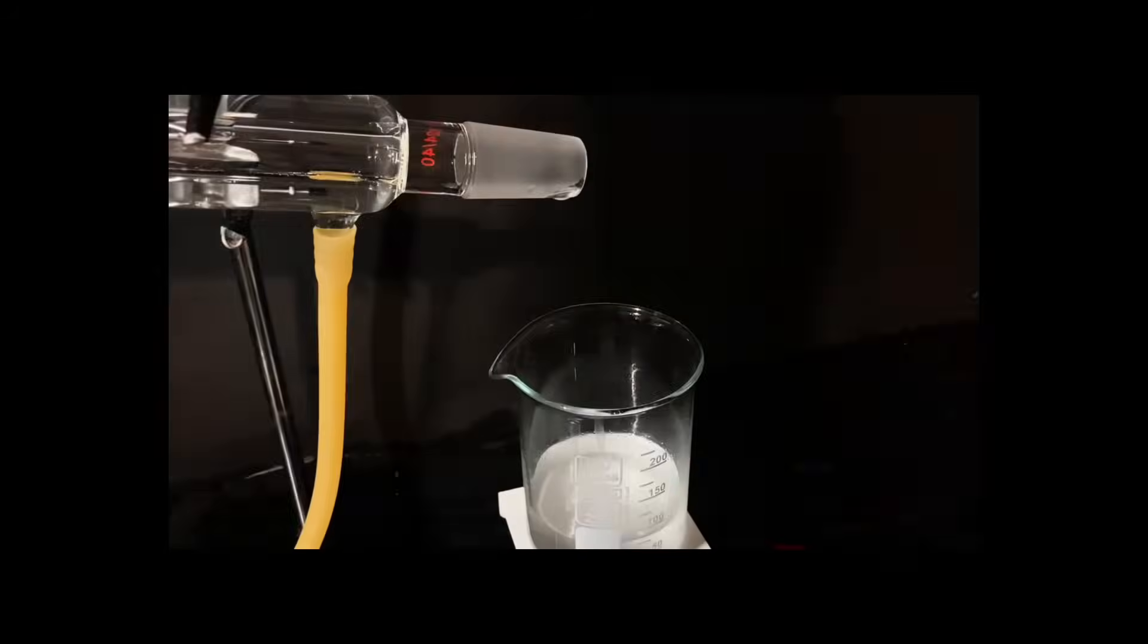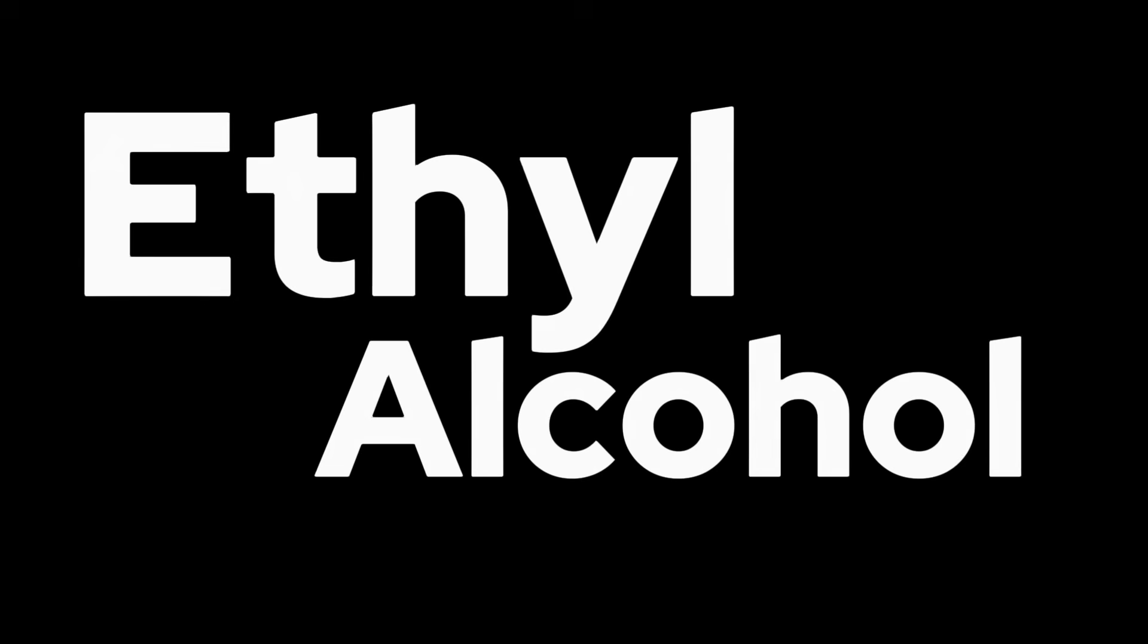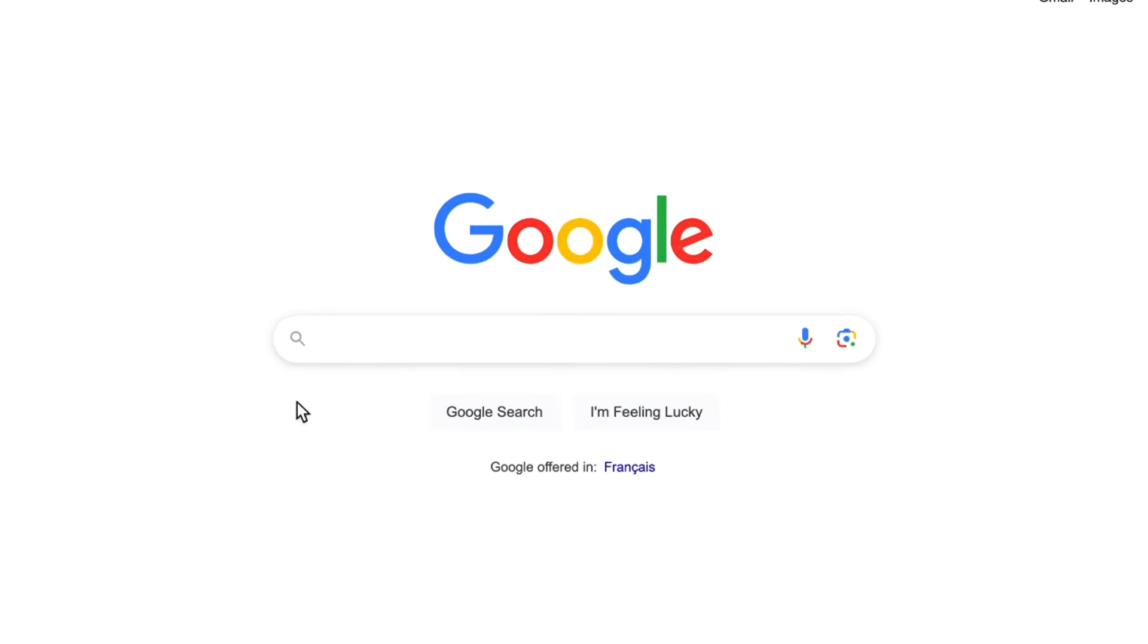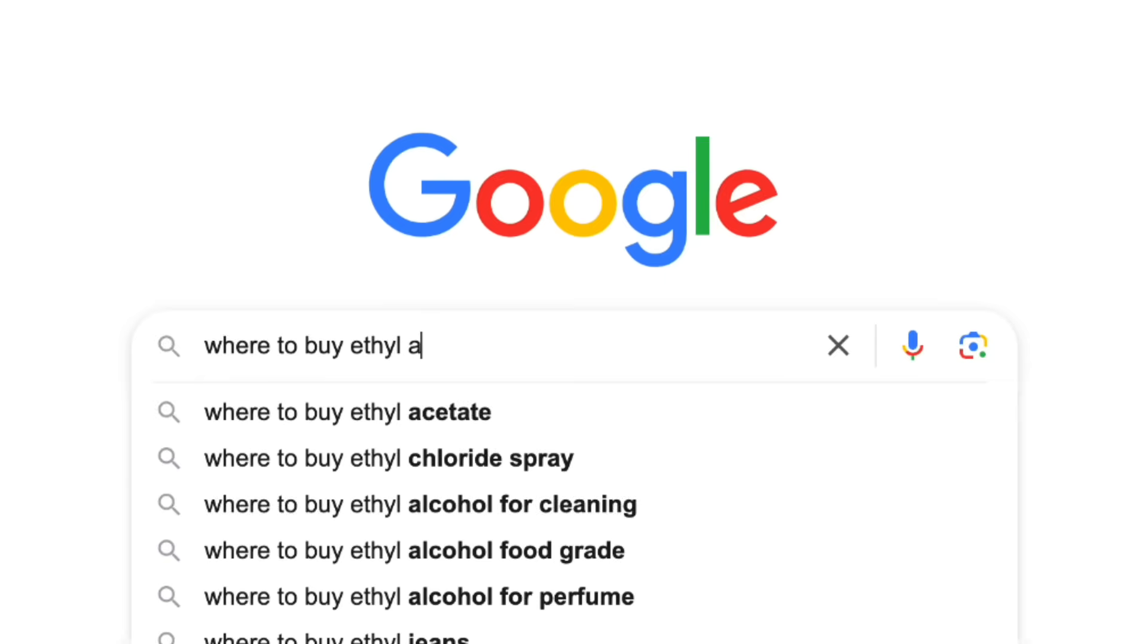In all labs, there's this one common chemical that is annoyingly difficult to buy at a pure concentration. It's ethanol, aka ethyl alcohol. All home chemists know it's a pain to get, and so the only way to obtain it is to make it.